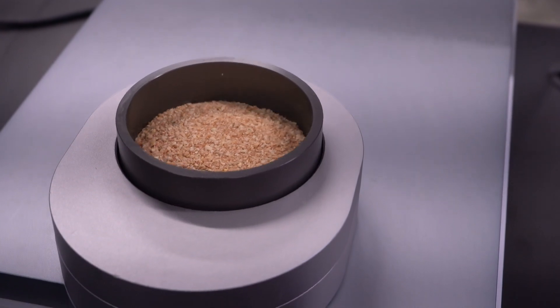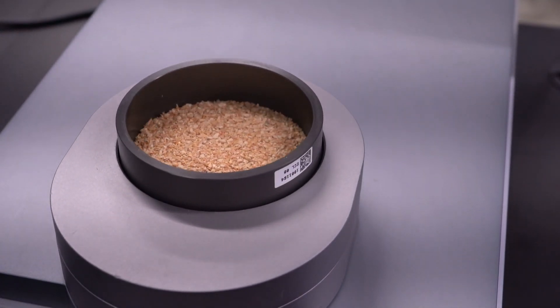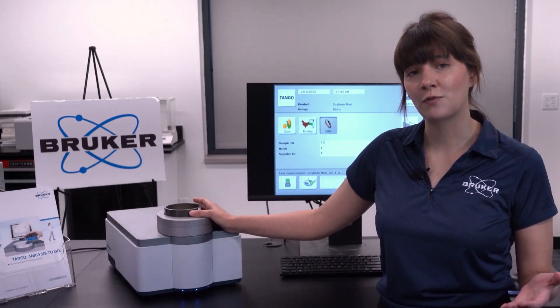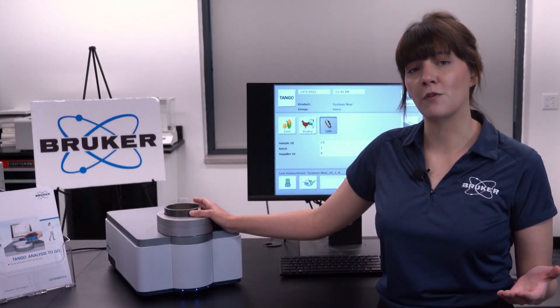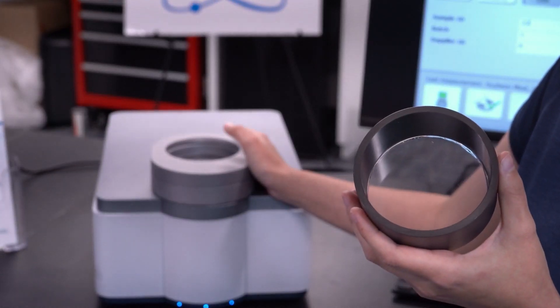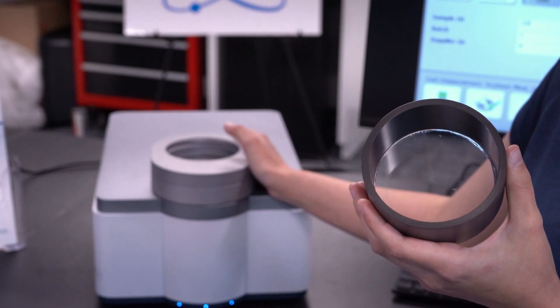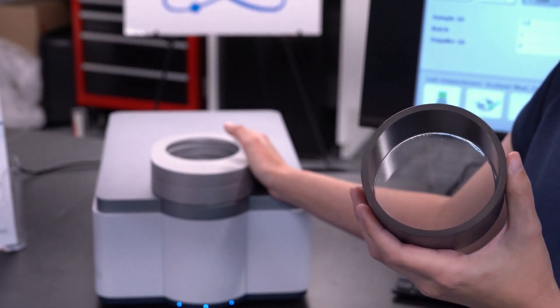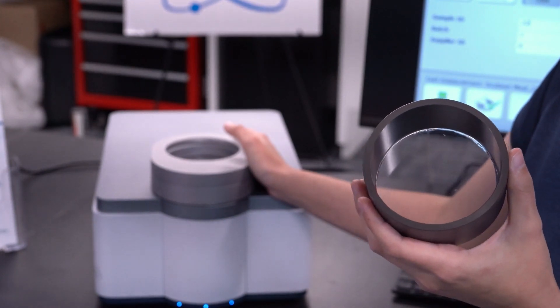The nutrient profile of any ingredient should be analyzed prior to diet formulation, so you know what nutrients are being delivered. So let's take a look at a quick and effective way to quantify our nutritional profile for our soybean meal. We're going to be using a 97mm cup with our rotator accessory for our soybean meal, as it has a larger surface area presented to our light, and thus we get a better representation of our entire sample, as well as achieve more reproducible measurements.